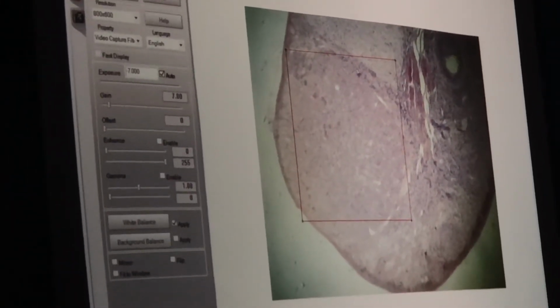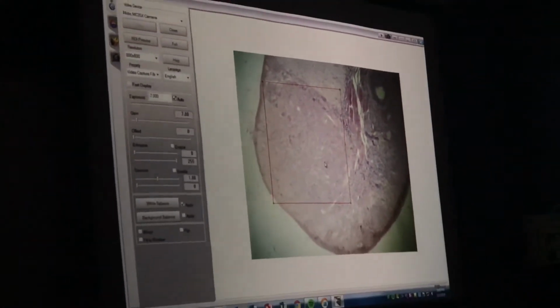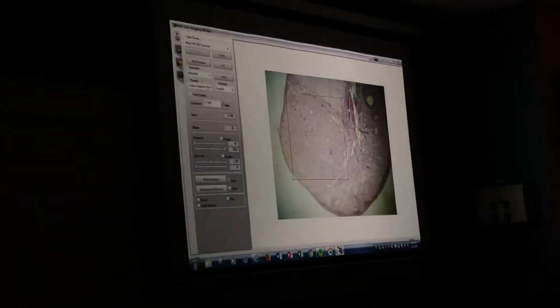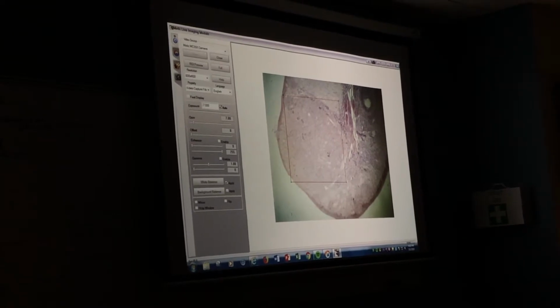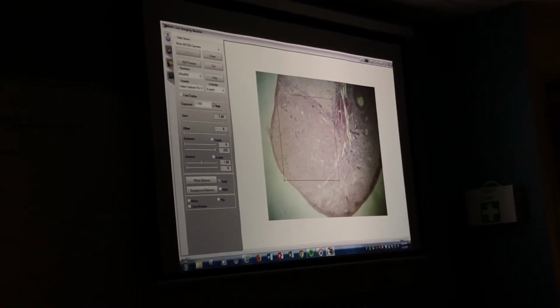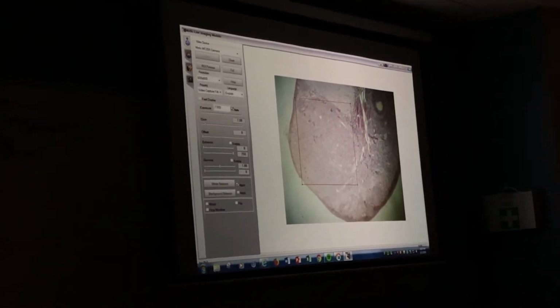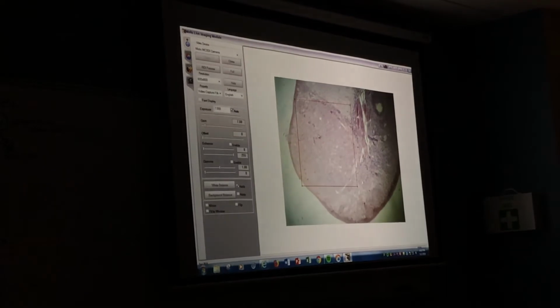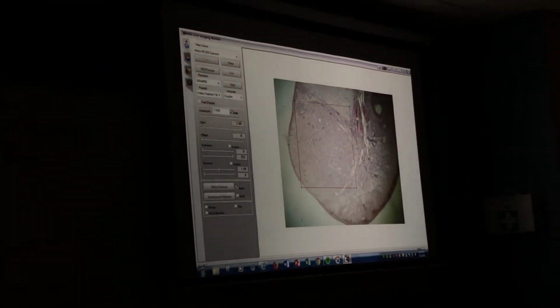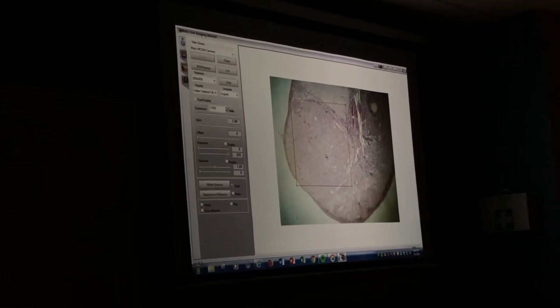Yeah, so kind of a big circular dense area. So again, I had a big antrum there. When the egg burst out, the antrum collapsed. So on some of the slides, you can still see where the antrum was, and it hasn't collapsed all the way. I like these ones because they collapsed and you can just see a big dense leftover thing of tissue. Over time, this will get smaller and become scar tissue that we call the corpus albicans. But right now, that's kind of a nice corpus luteum. All right?